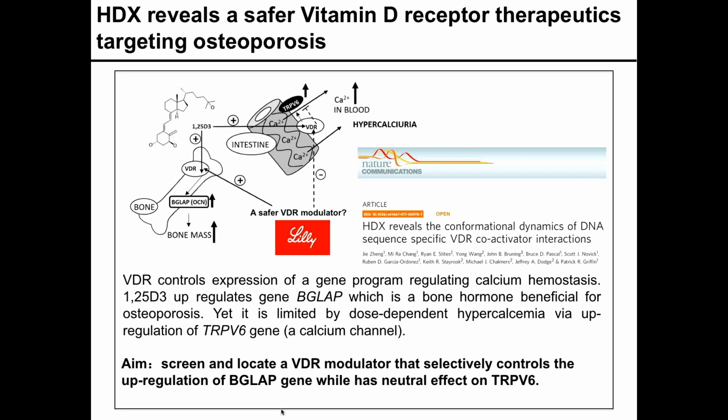I think one of the important questions from our study is why we use deuterium exchange: all proteins under physiological conditions are not rigid bodies. Our deuterium exchange data can be totally complementary to X-ray crystallography and cryo-EM studies. There's also huge demand in industrial application, where deuterium exchange can directly map protein dynamics and protein-ligand interactions, where they look at SAR studies with a huge number of compounds derived from the lead compound in the drug discovery procedures, and deuterium exchange can really speed up the drug discovery procedure.